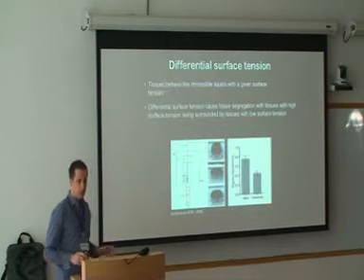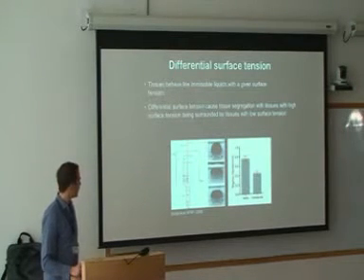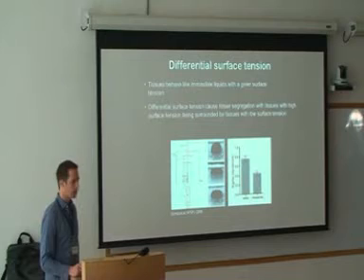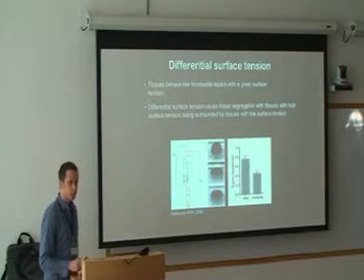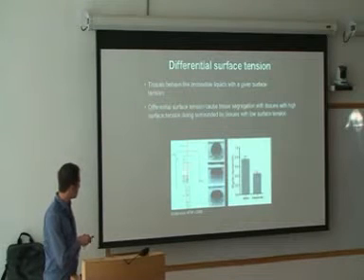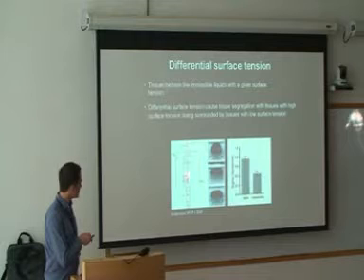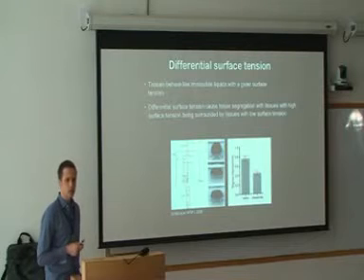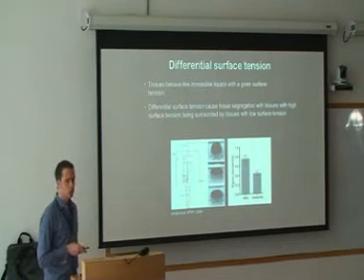Okay, so the first way to see if differences in surface tension between the different germ layer tissues might determine their segregation behavior was actually measuring these properties, tissue surface tension. And we built a little machine which is very similar to a machine which had been used for many years. It's a very simple machine which has two metal plates. One is up here, another one is down here. And what you can do is take a little piece of germ layer out of the embryo containing perhaps 100 or 200 cells.